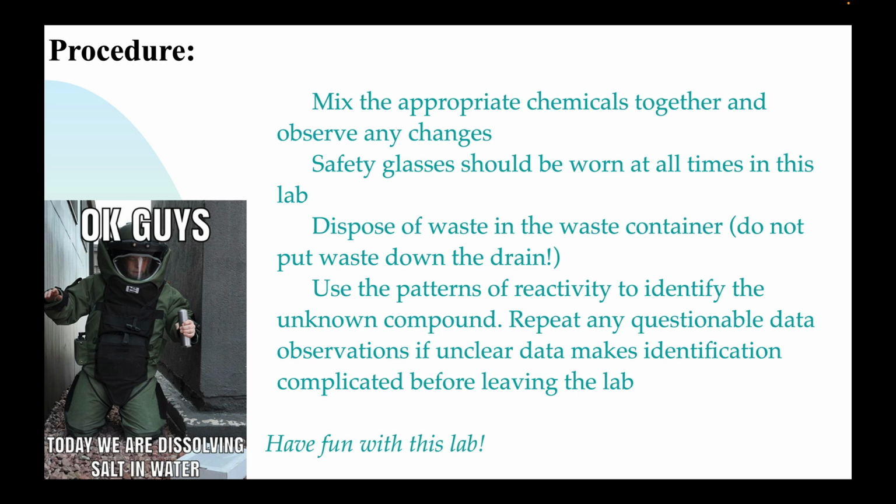If you have a pattern of reactivity that's not quite the same as one of your knowns, it's a good idea just to repeat it, all right? So if you added sulfuric acid to a chemical and it went clear, and another time you added it to a different compound and it was yellow, but everything else was the same, repeat that one experiment, all right? It's not a bad idea, because once in a while when you're doing experiments, there's a mistake made, and if you repeat it, you can confirm or deny what the actual results will be.